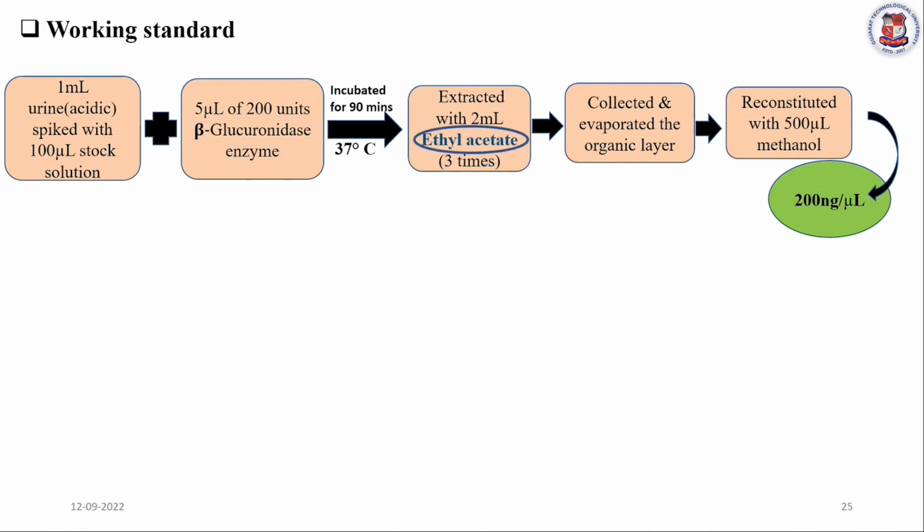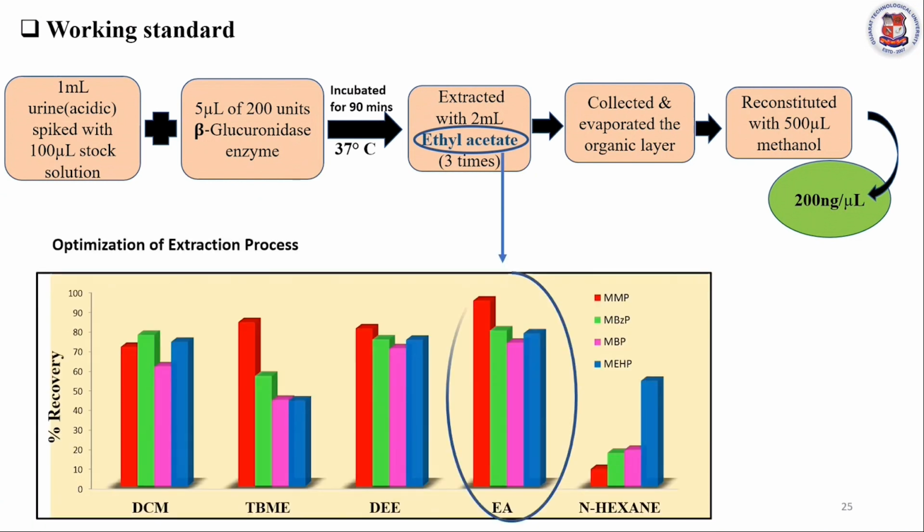Then for the extraction solvent, we selected different organic solvents for this study, like dichloromethane, TBME, diethyl ether, ethyl acetate, and hexane. At the end, we observed significantly better recovery with ethyl acetate than the other extracting solvents.